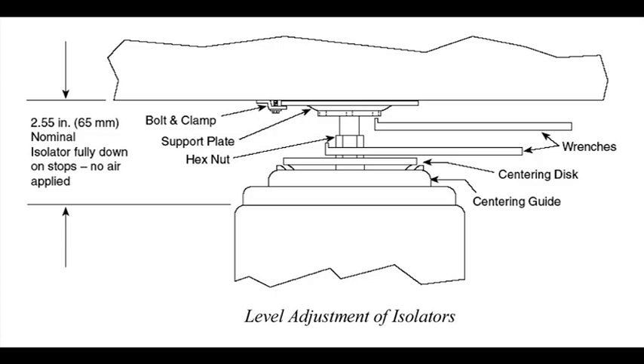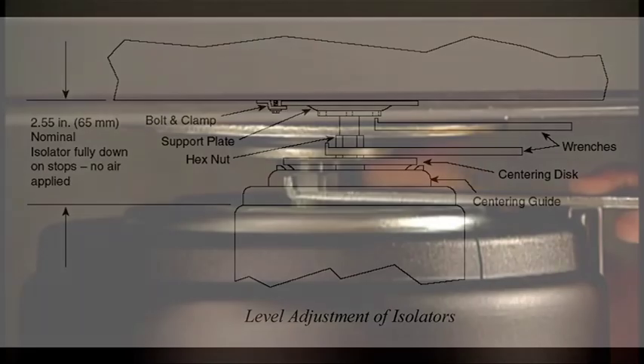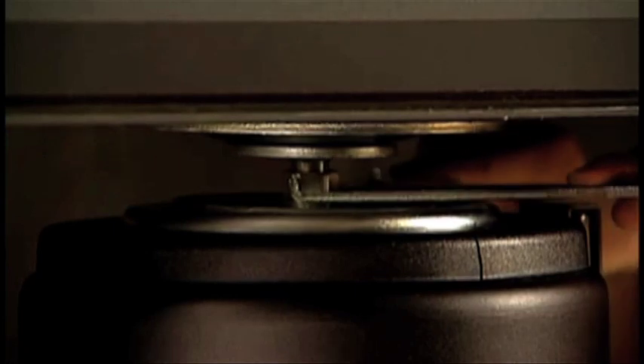If you are using air-filled isolators, do not float the system until the entire table system assembly is complete. It is also recommended that you adjust the height of the base unit legs to its midpoint to allow the next section enough adjustability for both sections to become level.